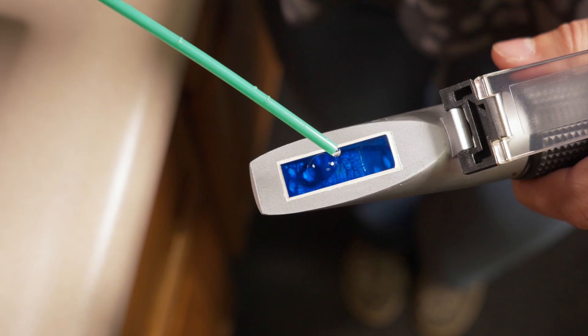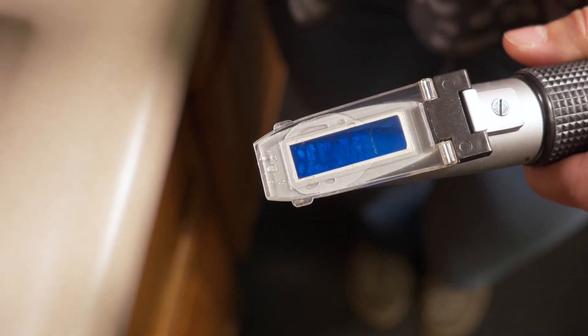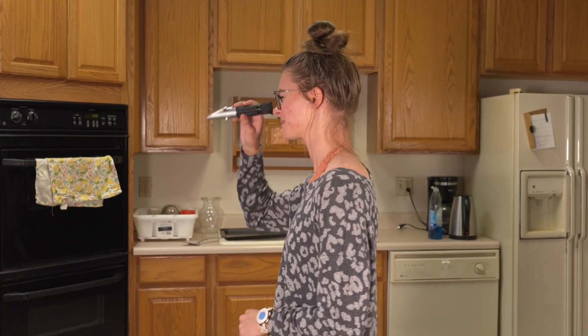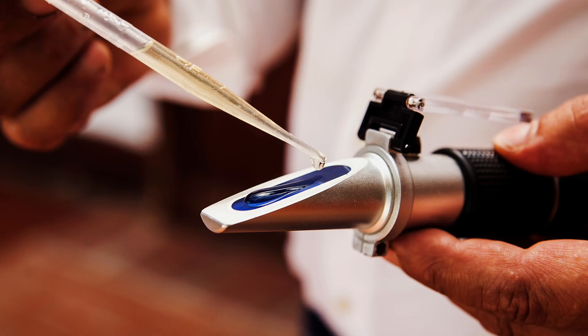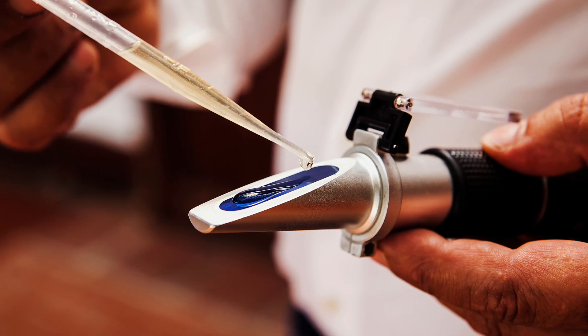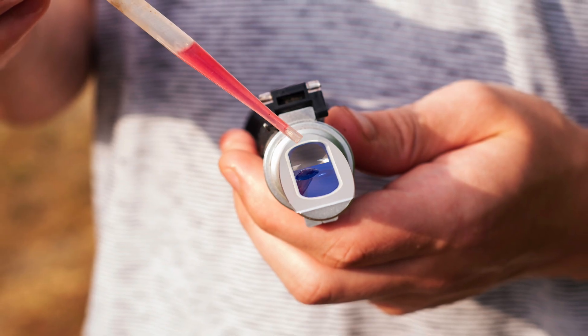For example, refractometers measure the concentration of sugar in aqueous solution in units called bricks. It's important to note that some types of refractometers only operate within a specific range. Therefore, it is extremely important to choose the correct type so measurements will be accurate and meaningful.